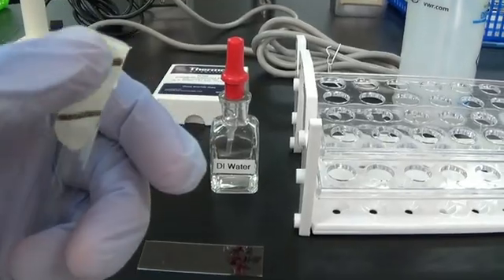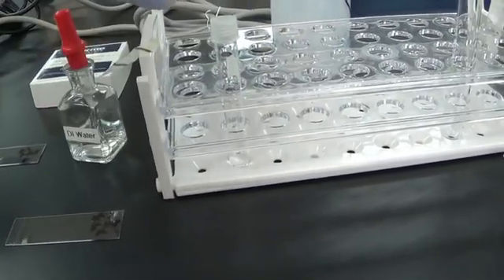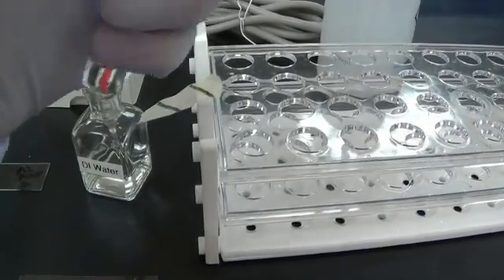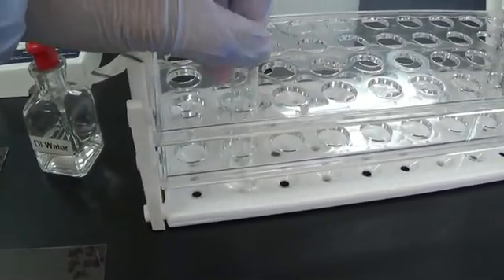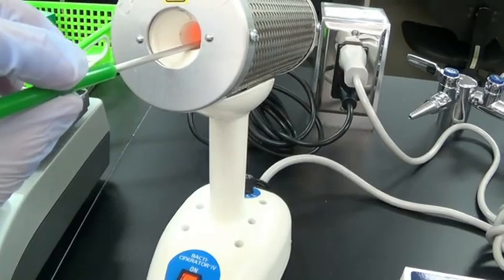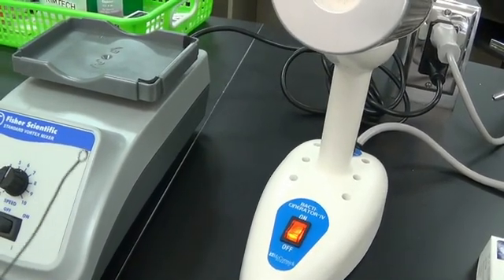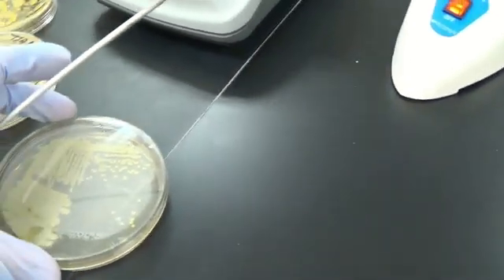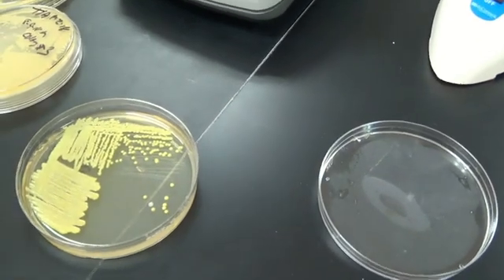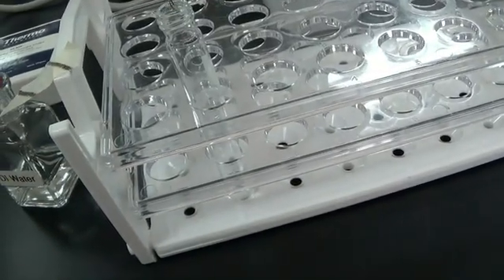The black tape means it was sterilized. I take the tape off, take the cap off, take my loop, sterilize it counting to four, let it cool counting to ten. Then I find a colony that is all by itself, and put the loop with the colony into the sterile saline.